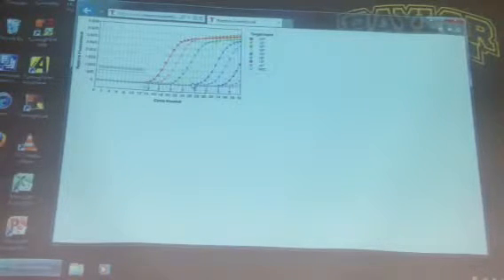So how do you know exactly? In the old days when they were doing PCR and tried to do it quantitatively, they would have to stop it at every cycle and then run it on a gel and figure out where it's going to happen, because which cycle you stop it at determines how much you're going to see, and if you're going to see a difference between one amount and another. And mind you, these amounts are orders of magnitude different, right? Each one is tenfold different. So using PCR to estimate the concentration of mRNA was a very dicey proposition.